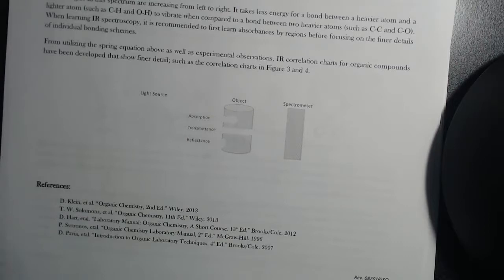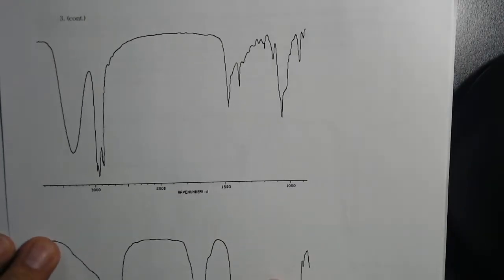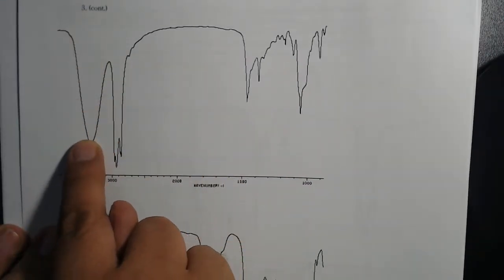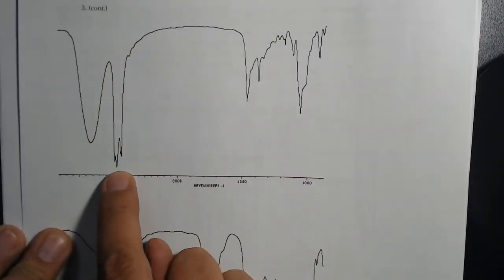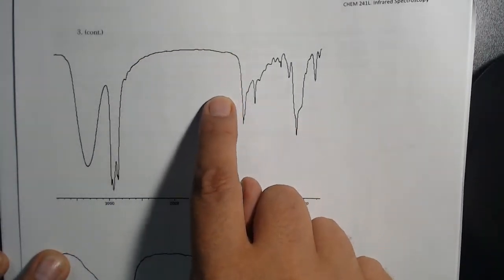All right, if you guys have been studying at all, is IR data presented as absorption or transmittance? What's that? It's shown as transmittance. So the way we look at IR data is that signals come downward. These graphs might appear upside down from what you're used to seeing from general chemistry. Looking at this chart right here, a signal is the minimums, so that's a signal coming down here. I don't want you to think that this part coming up is a signal. The baseline is up here.